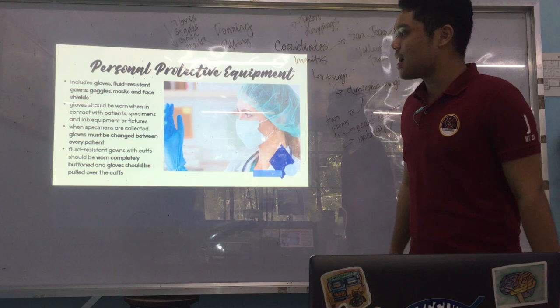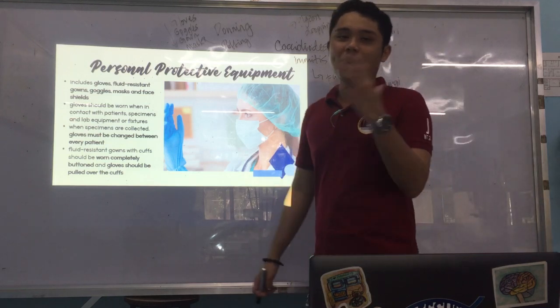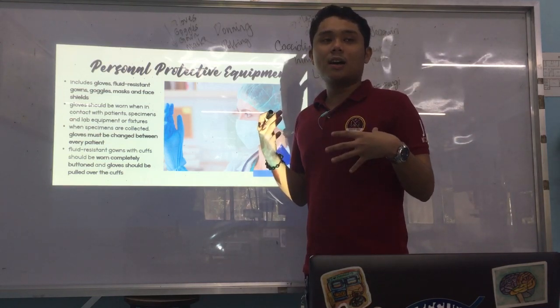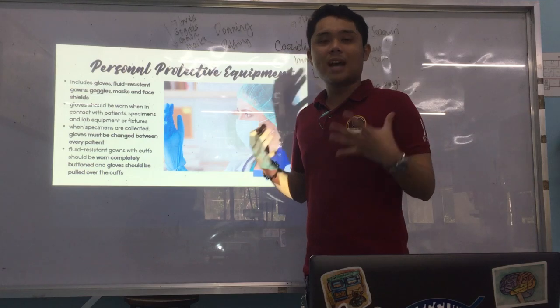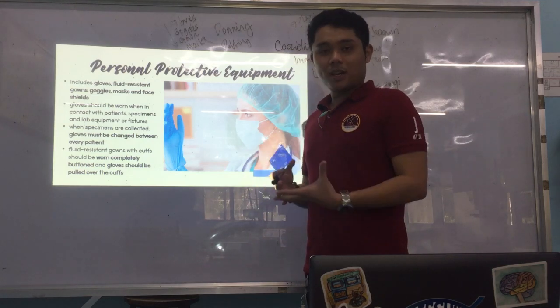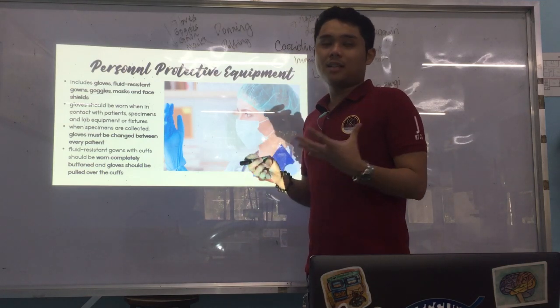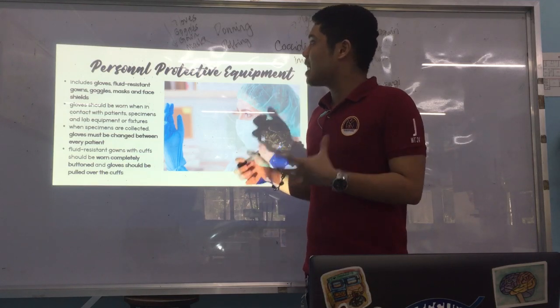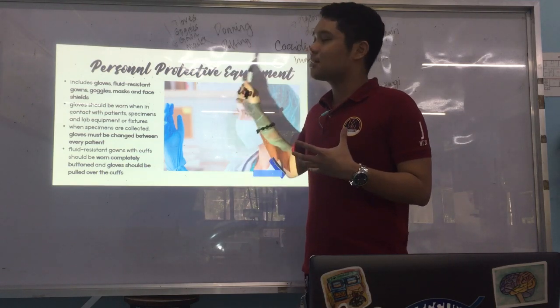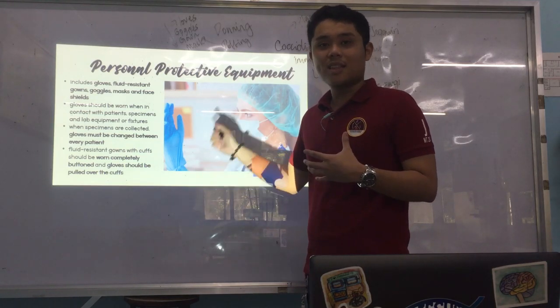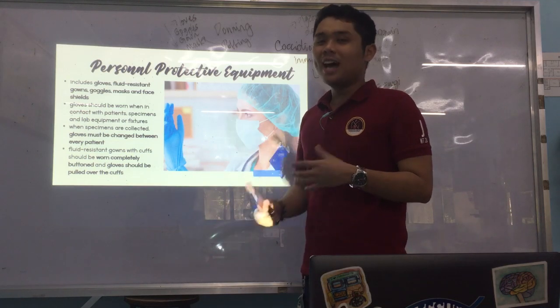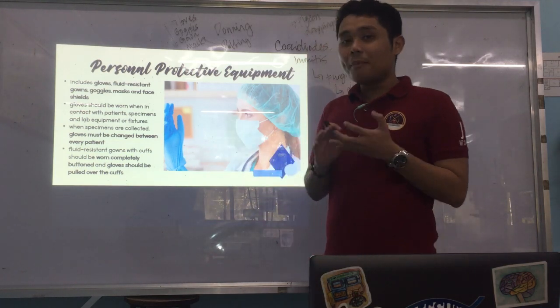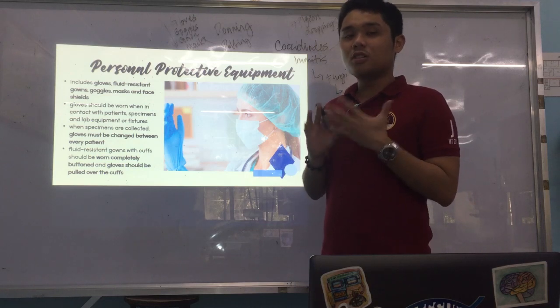Next is your PPE — personal protective equipment. This is one of your best friends in the lab, and especially now during the pandemic it is given much more importance. Personal protective equipment includes your gown, mask, goggles, and gloves. For donning — meaning how to wear your PPE — you start with your gown, then your mask, then goggles, and finally your gloves.